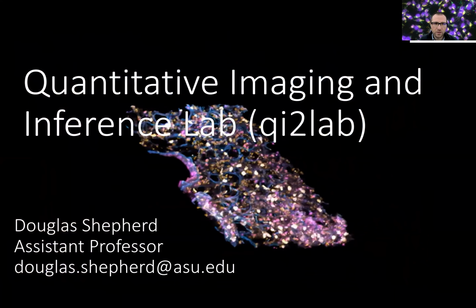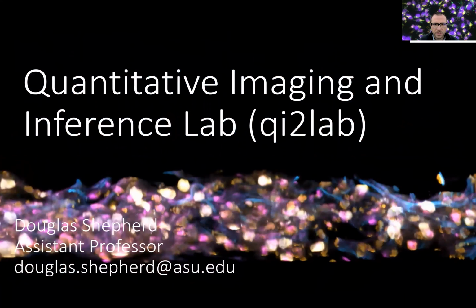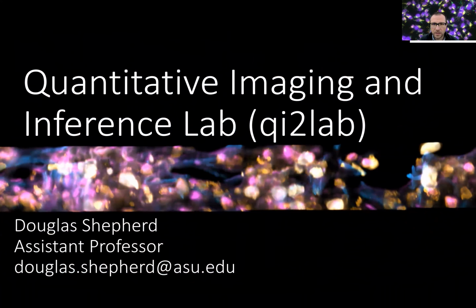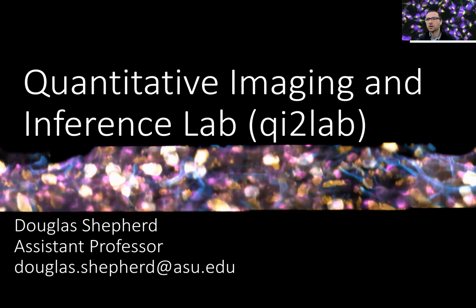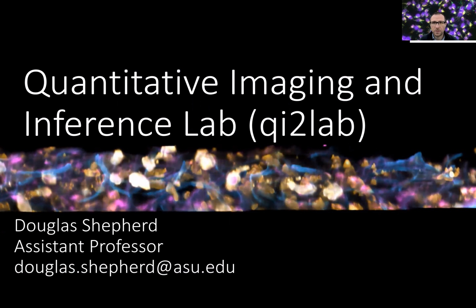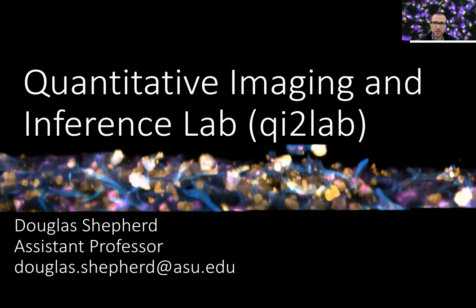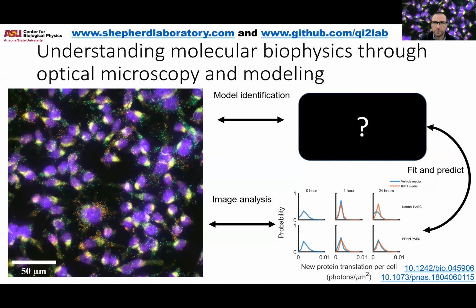And so what we have here is a movie of rat lung. And so inside this tissue, we've labeled connective tissue in cyan and then different cell types in the other colors. So we can actually build up these large, three-dimensional data sets that can also have time components and then use these dense data sets to try and build a quantitative understanding of the regulatory mechanisms in biology.